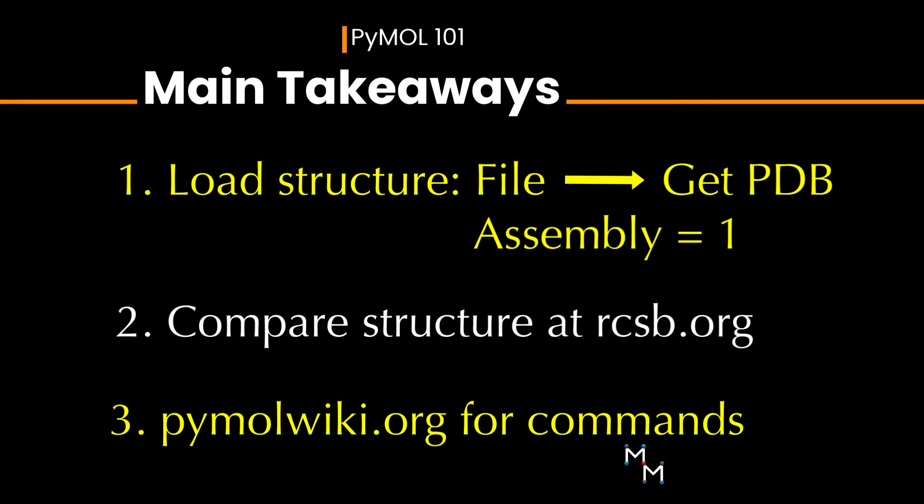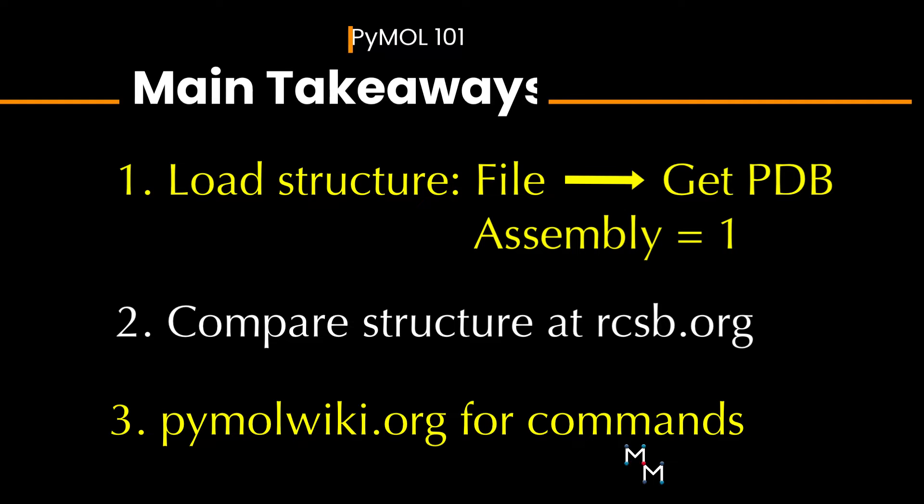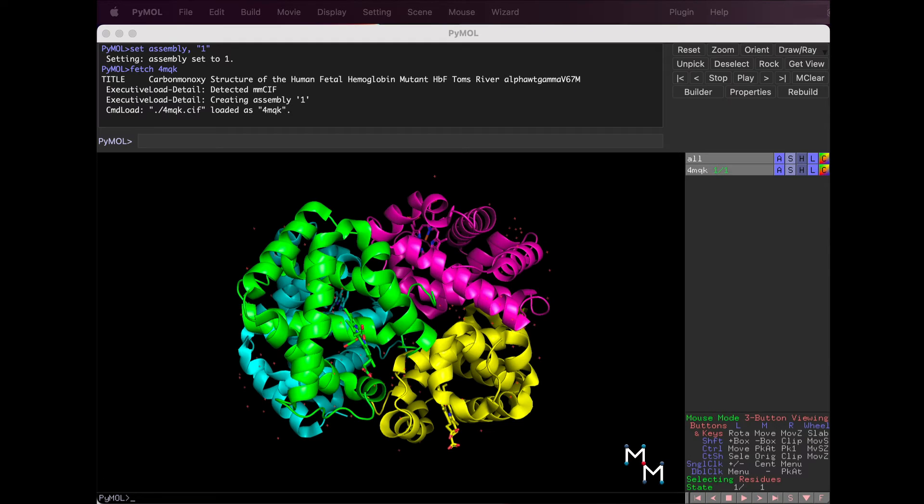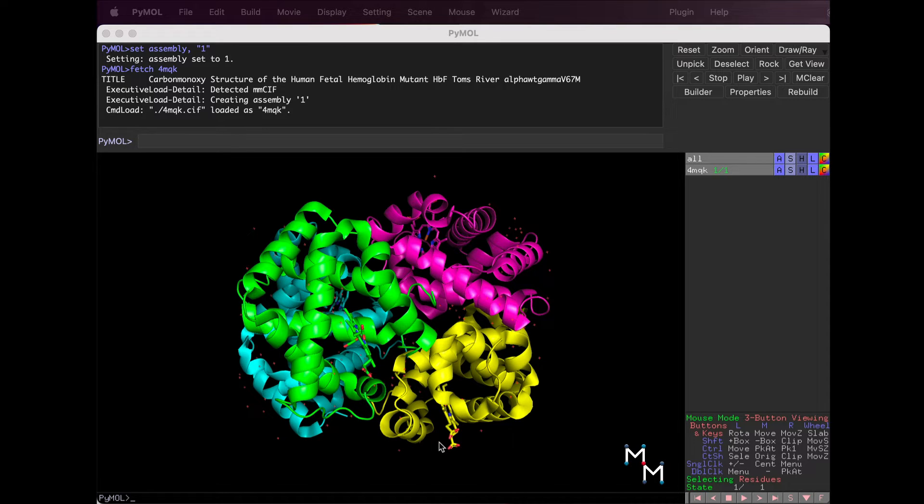Now, the whole point of using a structure viewer like PyMole is to get a sense of the molecule in three dimensions.